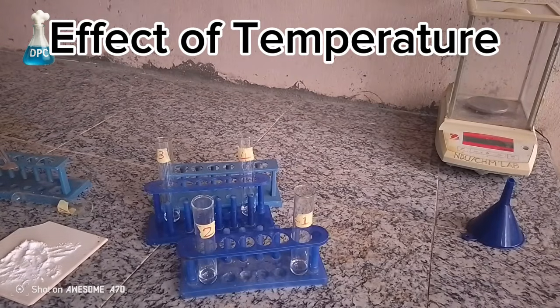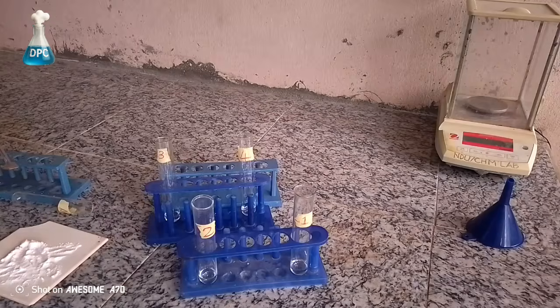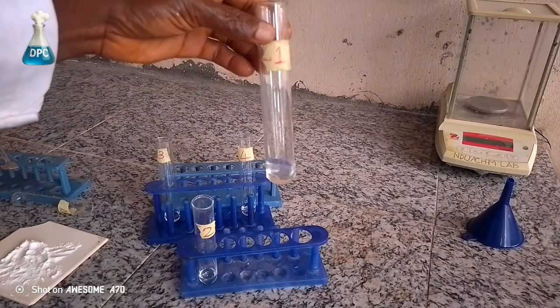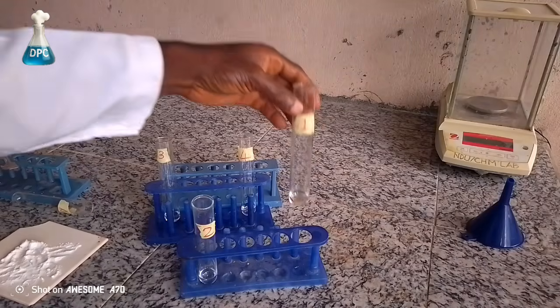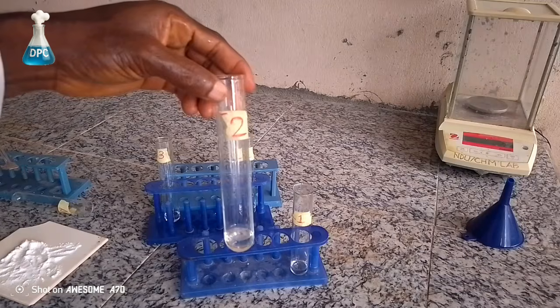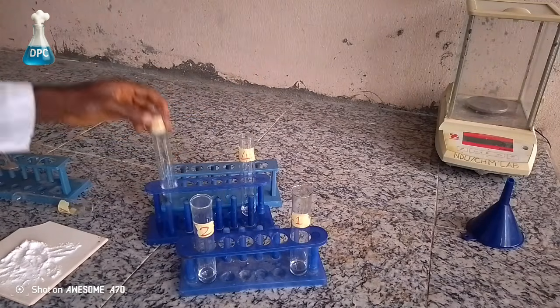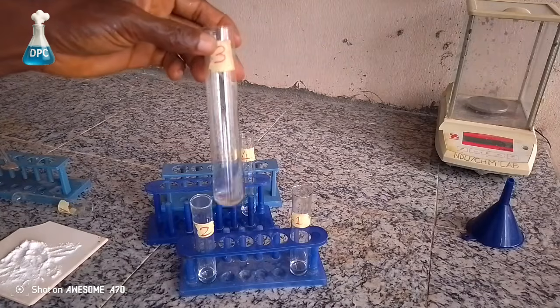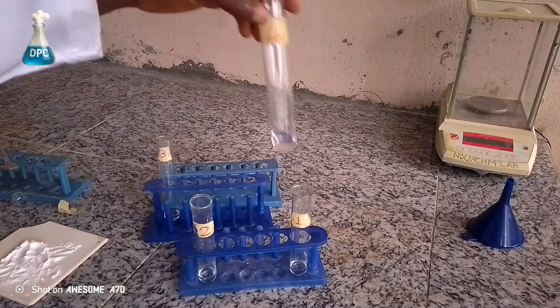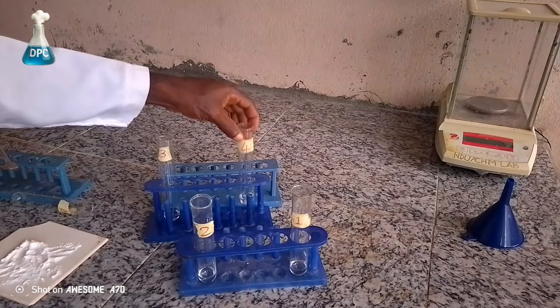Effect of temperature. Now, for effect of temperature, we have 4 test tubes. We label them test tube 1, test tube 2, test tube 3, test tube 4. Now, test tube 1 and test tube 2 will contain 3 ml of the acid, while test tube 3 and test tube 4 contain 3 ml of the base.